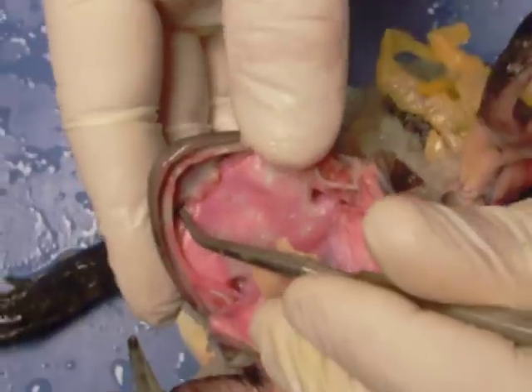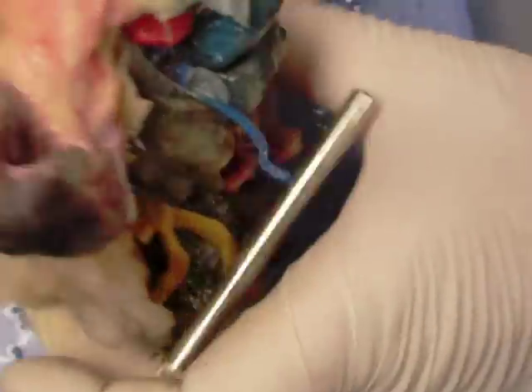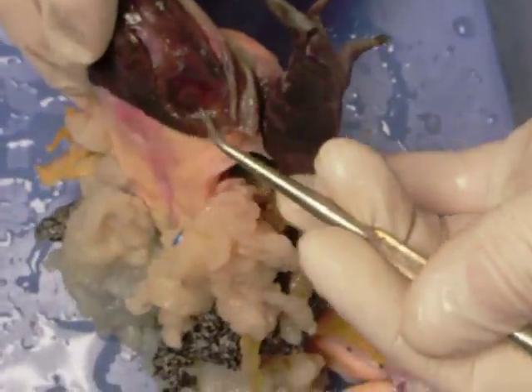Here we have the internal nares — one, two — and the external nares. So these holes lead to the inside of the frog. Just for comparison, we'll take a look at the tympanum on the female: it's about the same size as the eye, whereas compared to the male's, it's much smaller.